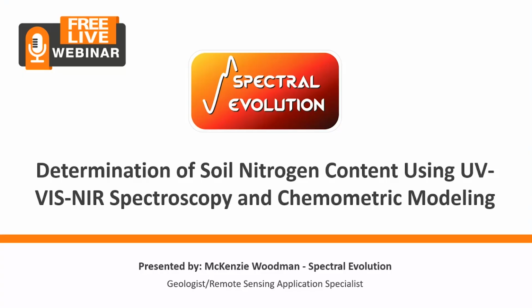And today we're going to be going over an indicative study in nitrogen quantification in soils. So we're going to be talking about determination of soil nitrogen content using UV-VIS-NIR spectroscopy and an overview of chemometric modeling.